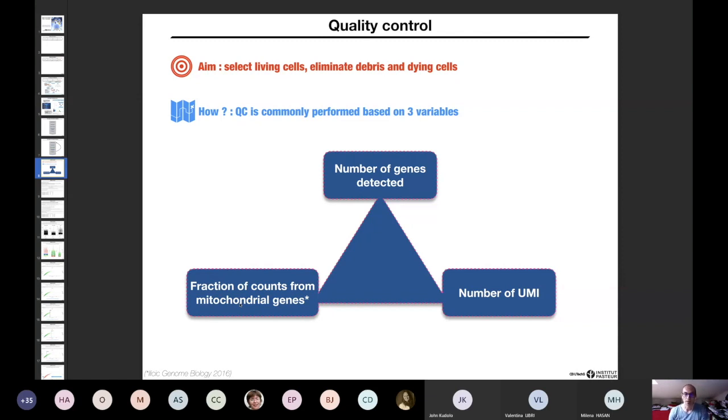For this talk, I wanted to keep it a bit practical, so I used a dataset that was available on the 10x website, and that was supposed to correspond to the one that we should have gotten for the course. That's 10x technology, and it's PBMC coming from a human sample.